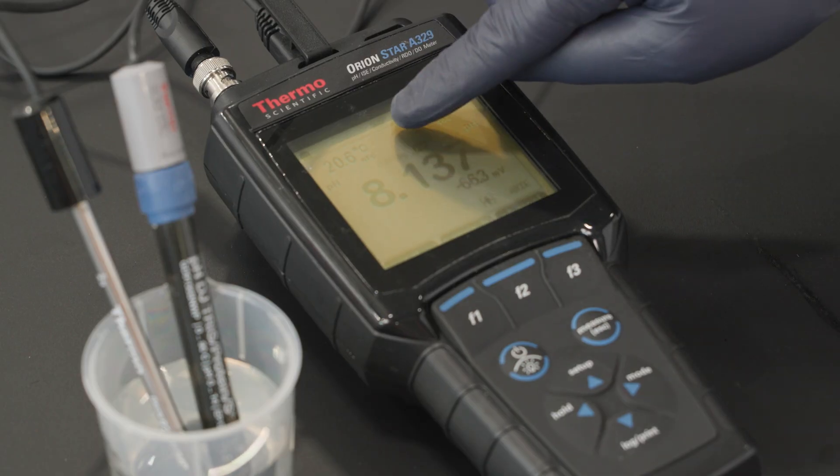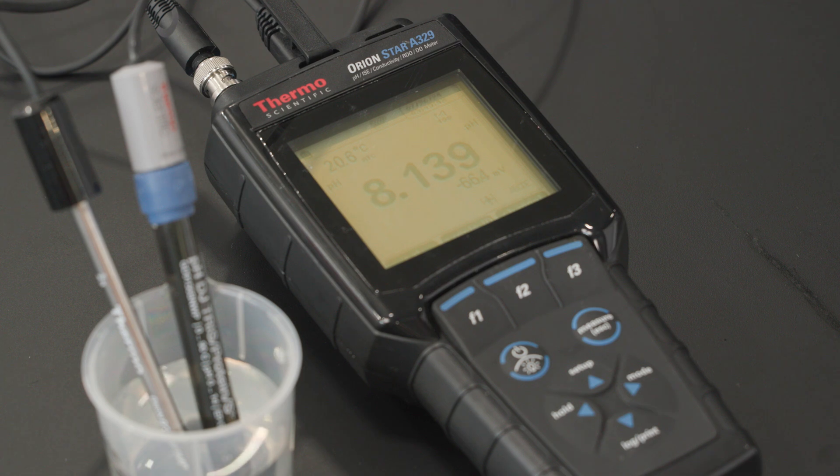Multipoint calibration can help give you the most accurate pH readings by using two or more buffer solutions for correct determination of slopes and offset.